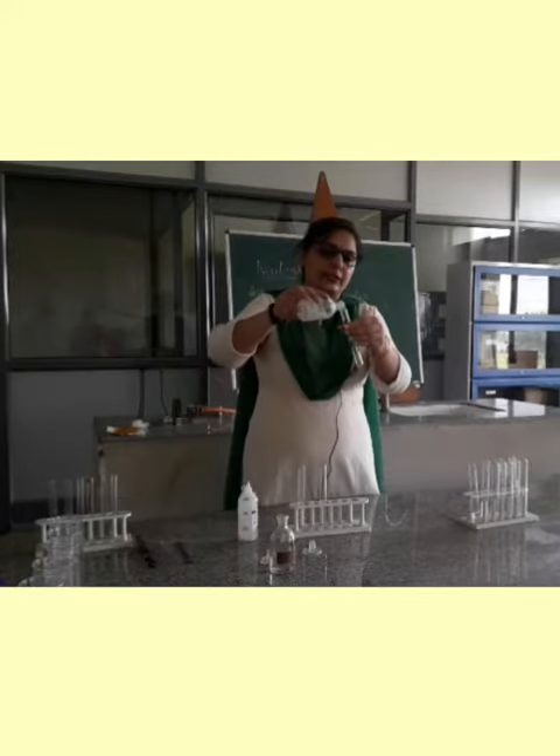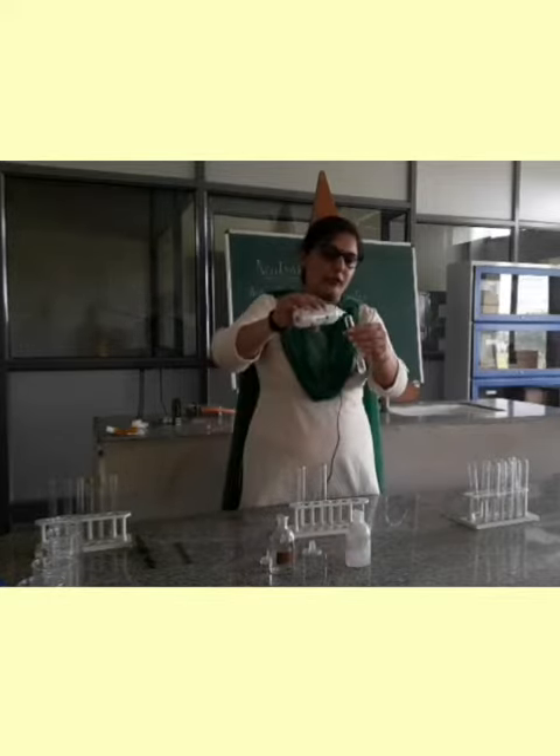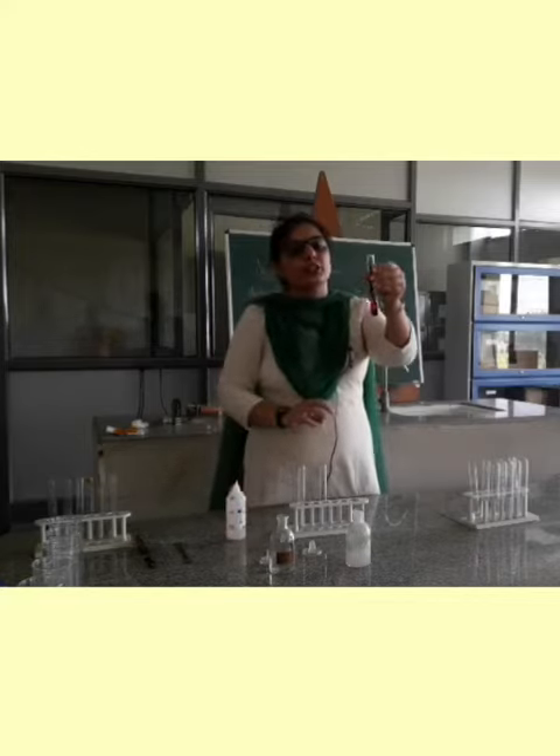Now, this is a base — sodium hydroxide. As I have shown you before, when I will be adding phenolphthalein in this, there will be a color change. The color has changed to pink.